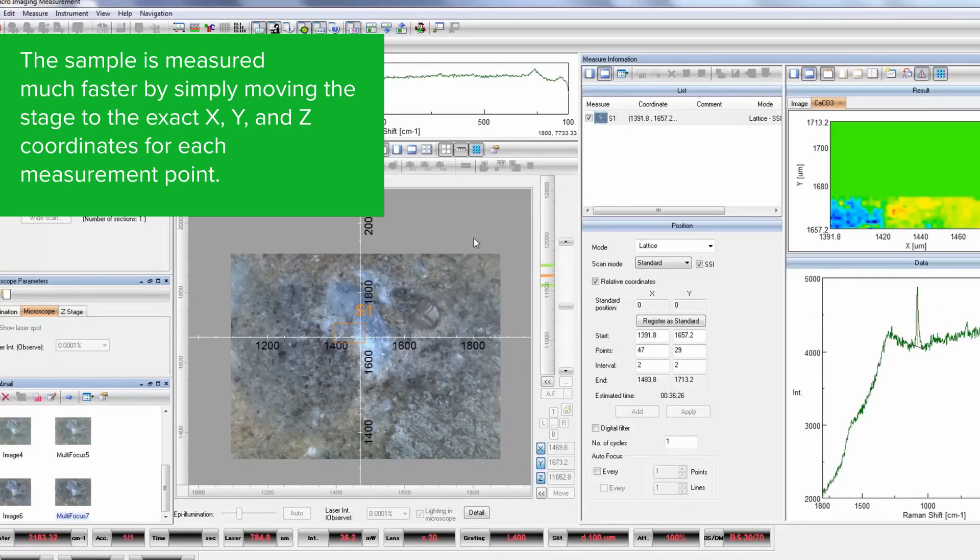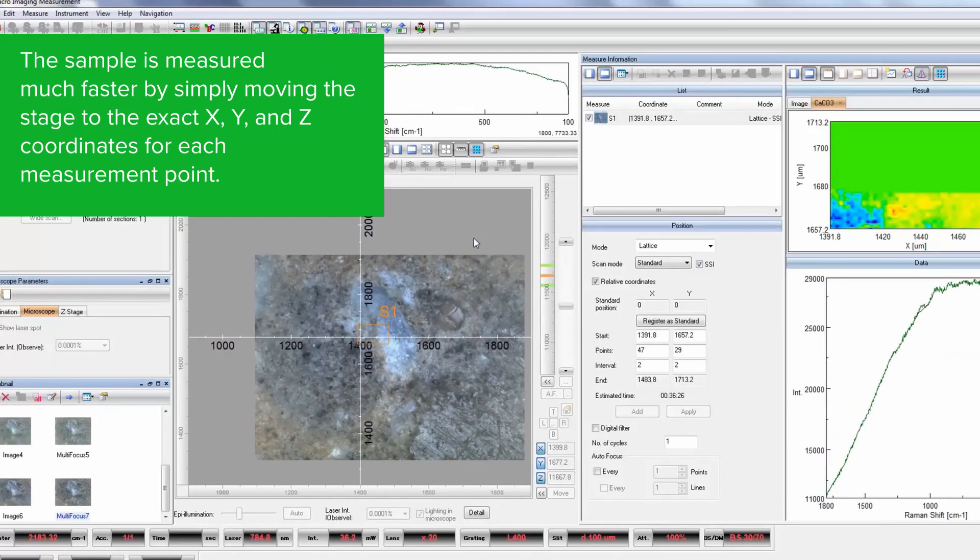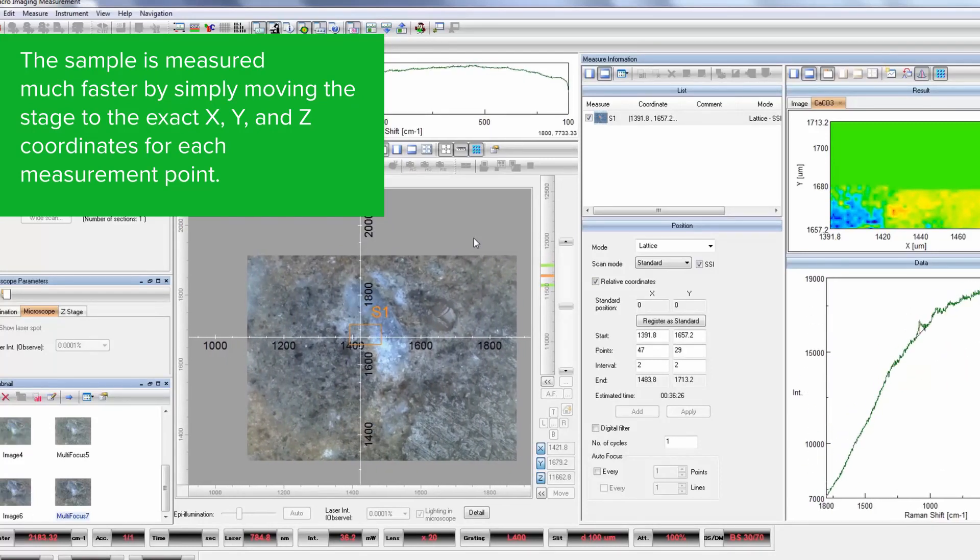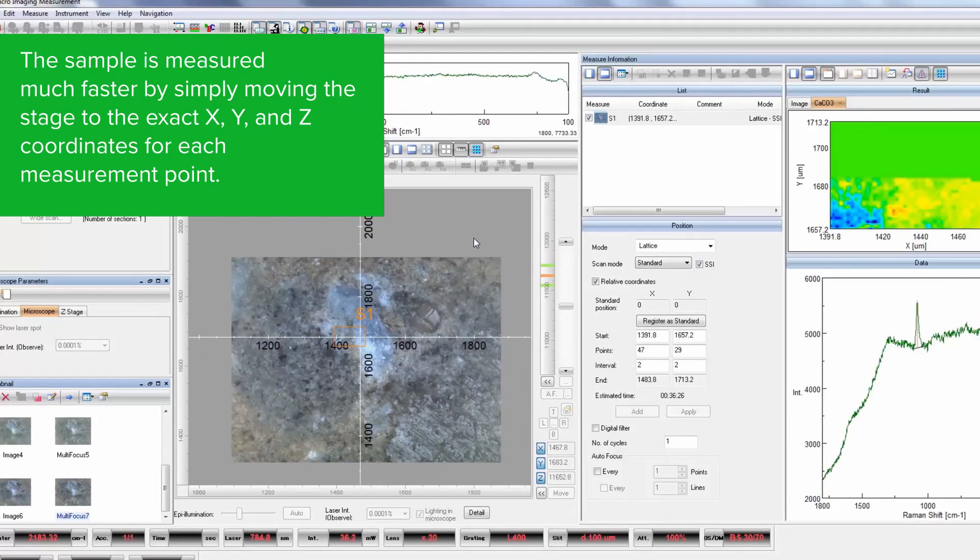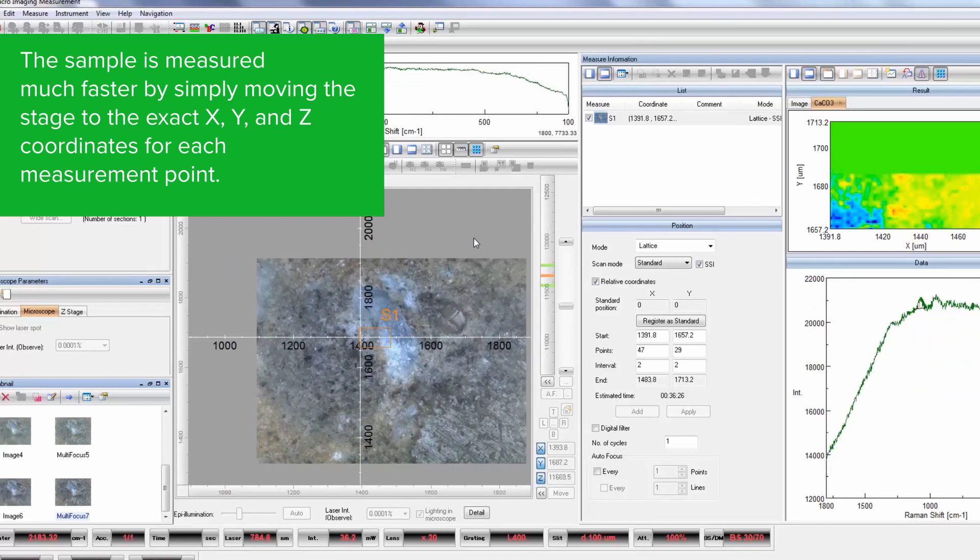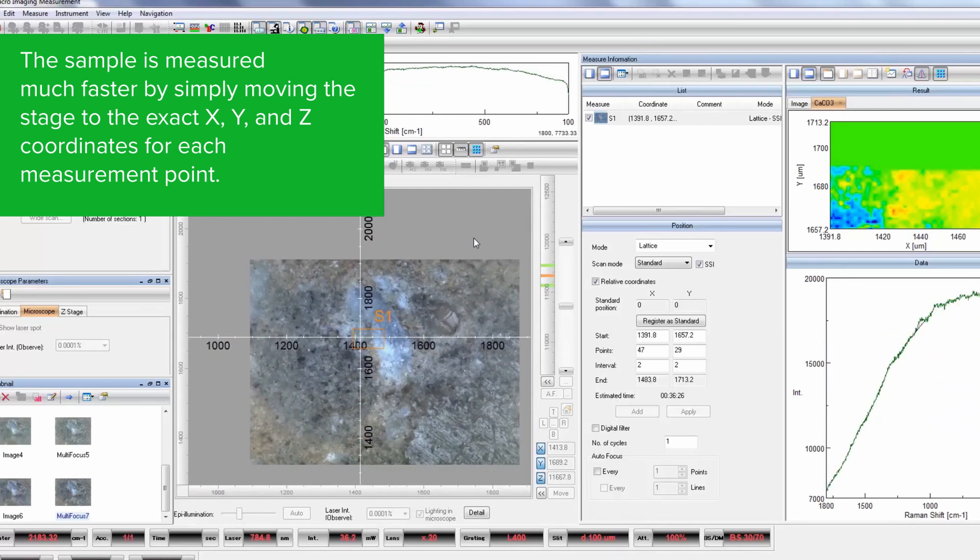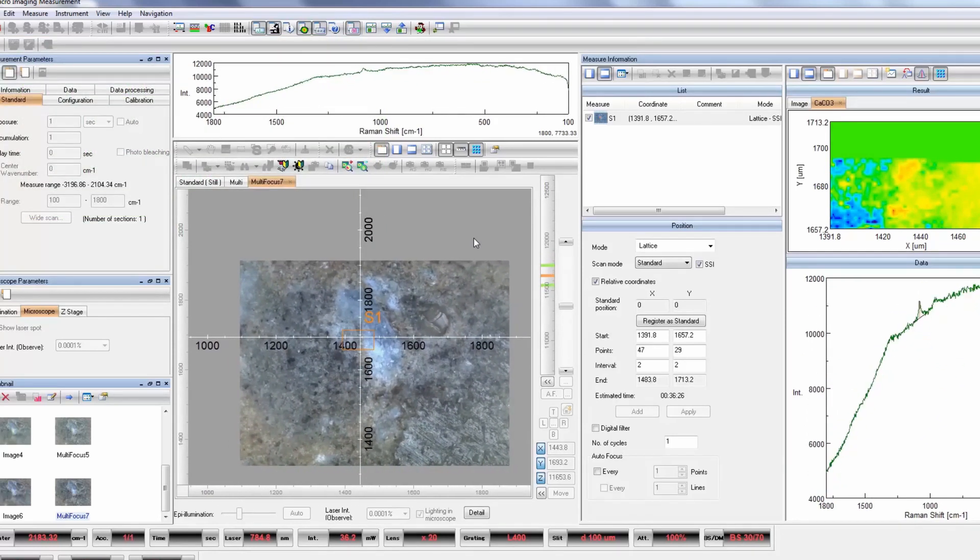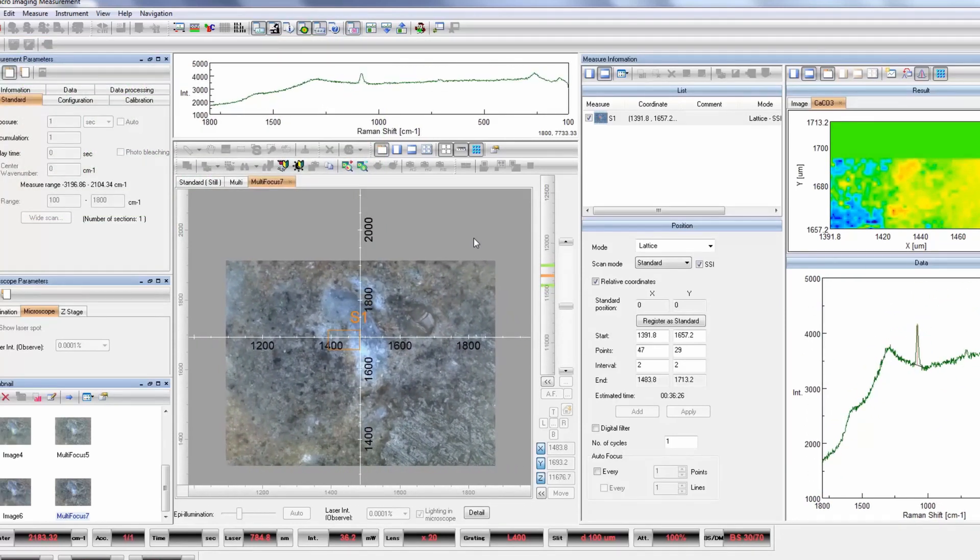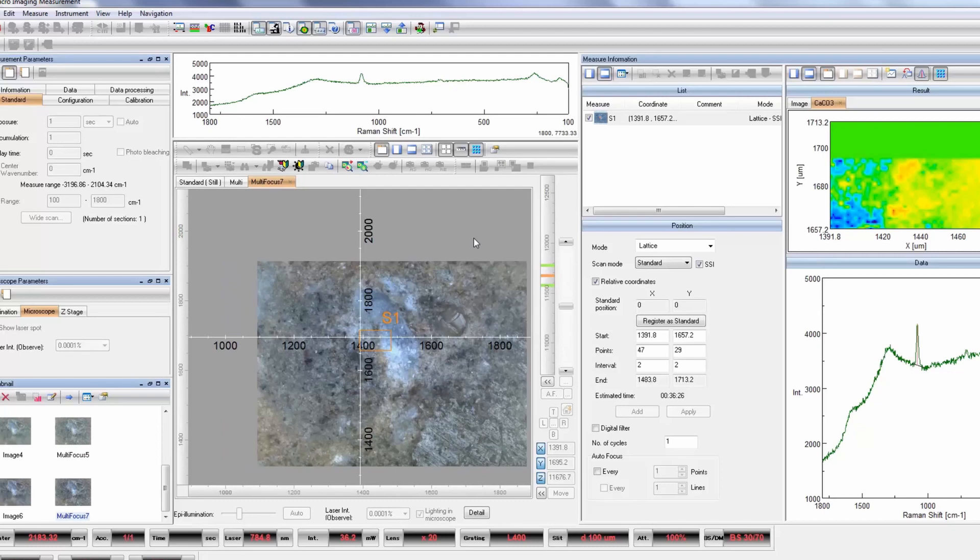SSI uses the all-in-focus image to generate a matrix of three-dimensional coordinates for the x, y, and z positions of the stage. This means it's not necessary to drive an auto focus at each measurement point.